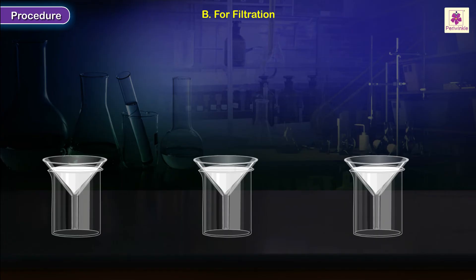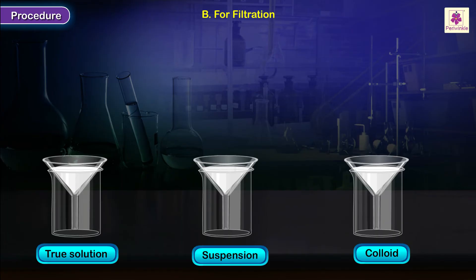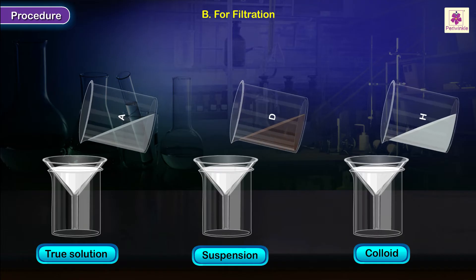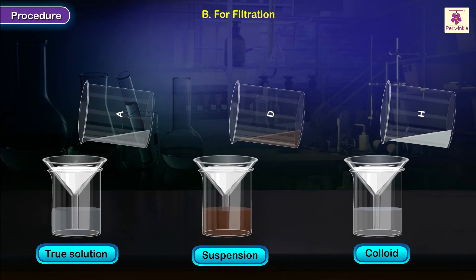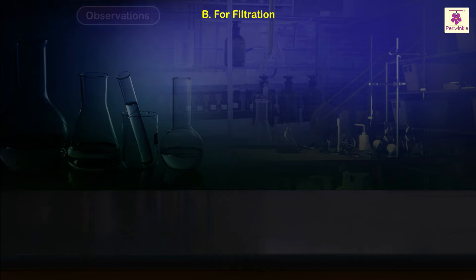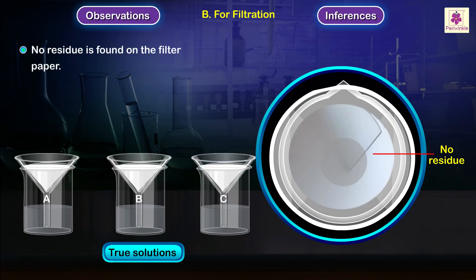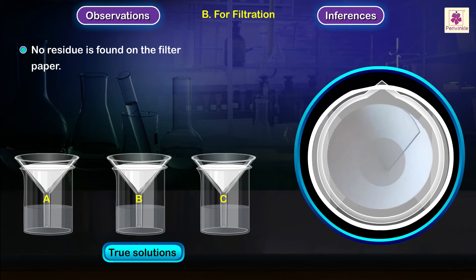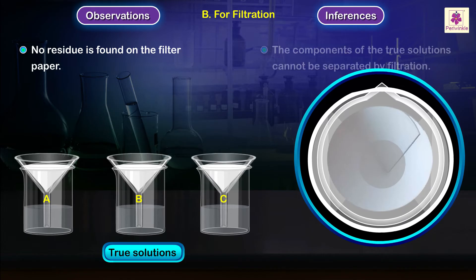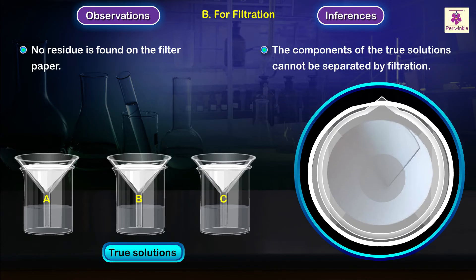For filtration, take all three types of solutions in labelled beakers and pass them through filter paper. Observations and inferences: No residue is found on the filter paper when the solutions of mixtures A, B and C are passed through it. The components of the true solutions cannot be separated by filtration.